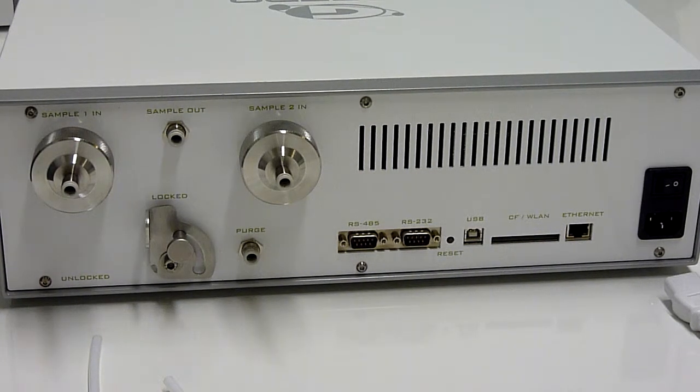What you see here is the rear view of the Gazera F10 and LP1 gas analyzer. I will now show you the electrical and gas connections of the instrument.